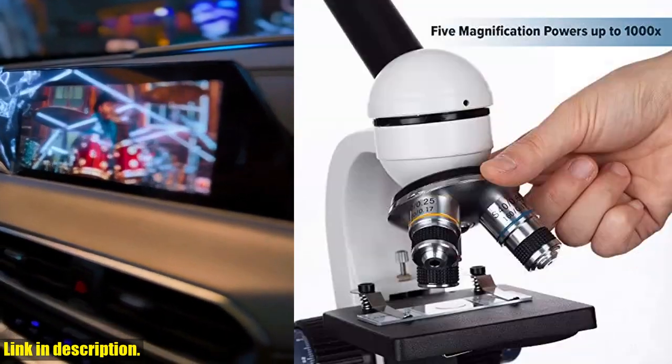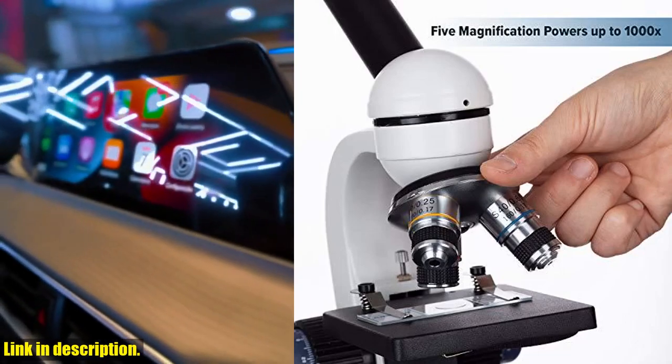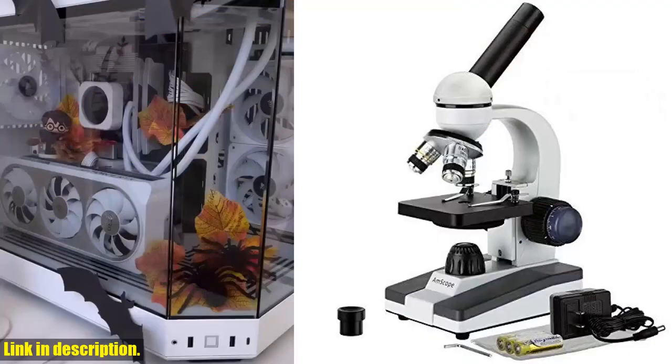It features a 360-degree rotatable monocular head with five magnification settings: 40x, 100x, 250x, 400x, and 1000x.